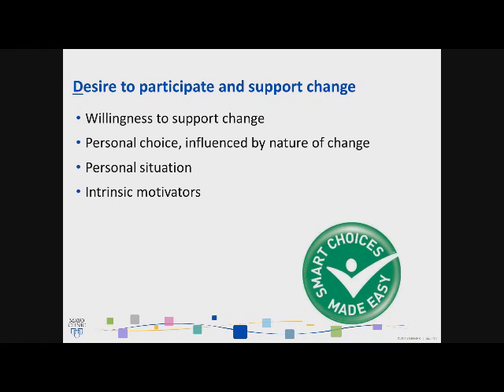Just think back to where we were 30 years ago, where people were smoking and eating and drinking, chewing gum, adjusting their contact lenses in the laboratory. We don't want to go backwards. We always want to strive to get better, to get safer, to just be more proficient in the laboratory. We always want to make sure our personal situation is safe and that our patients are really safe.